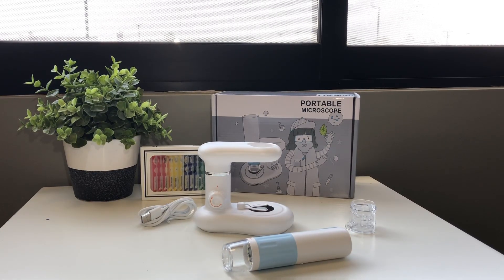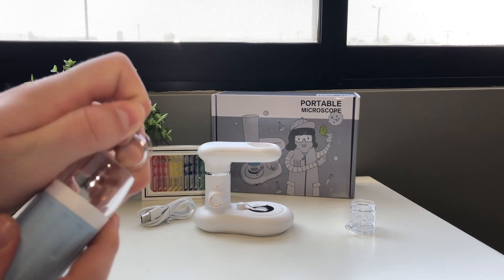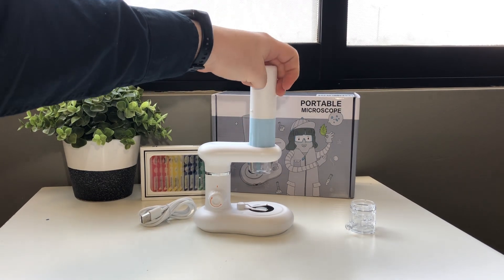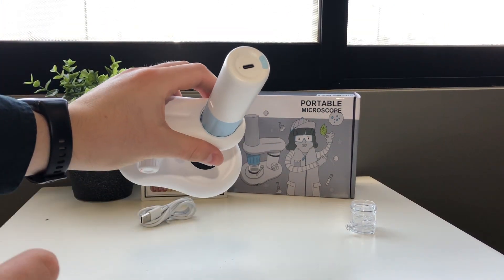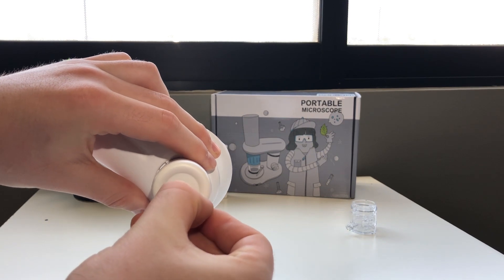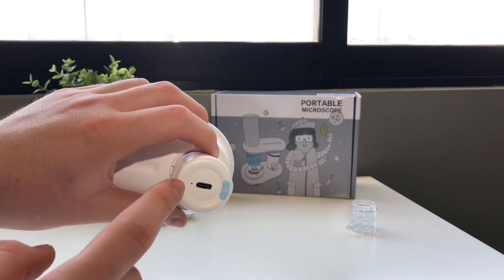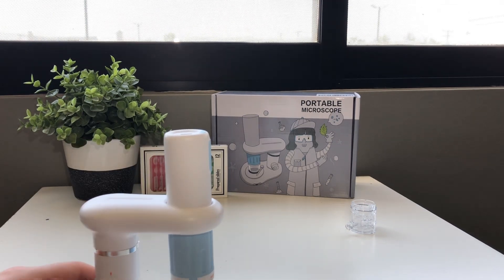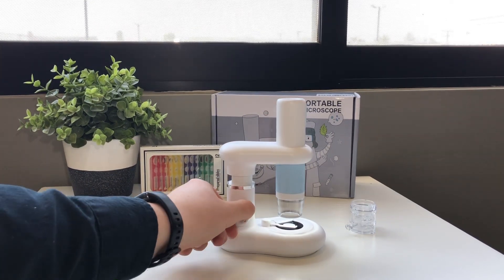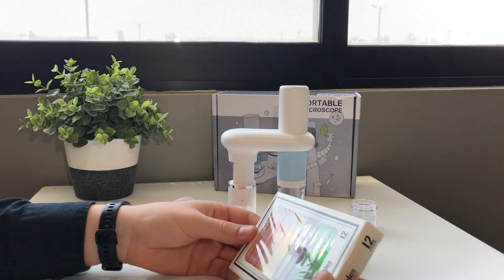Here we are, ready to use the microscope. As the manual says, we need to first get this little cap off the microscope — here it is. We'll put it like this. It has a little dent right here so you can get it positioned correctly. We'll turn on the microscope. We already have linked it to our phone, but this LED will show you if it's ready to connect or not. Now we're going to get this level up so we can get the samples right here.